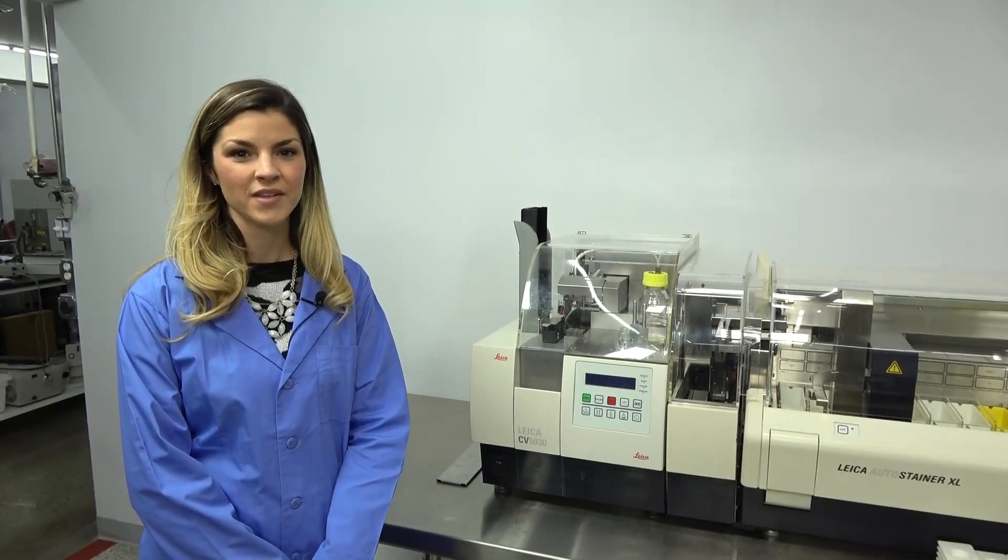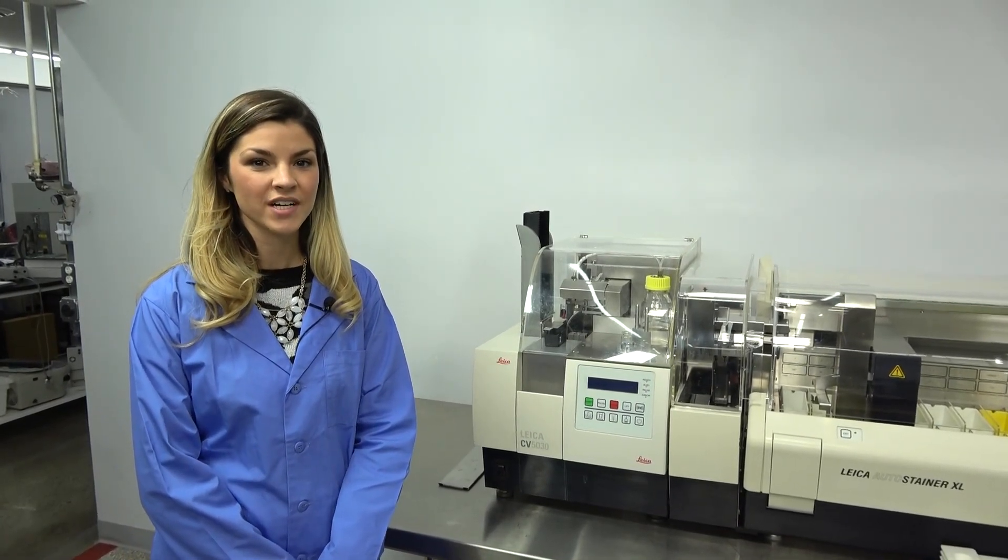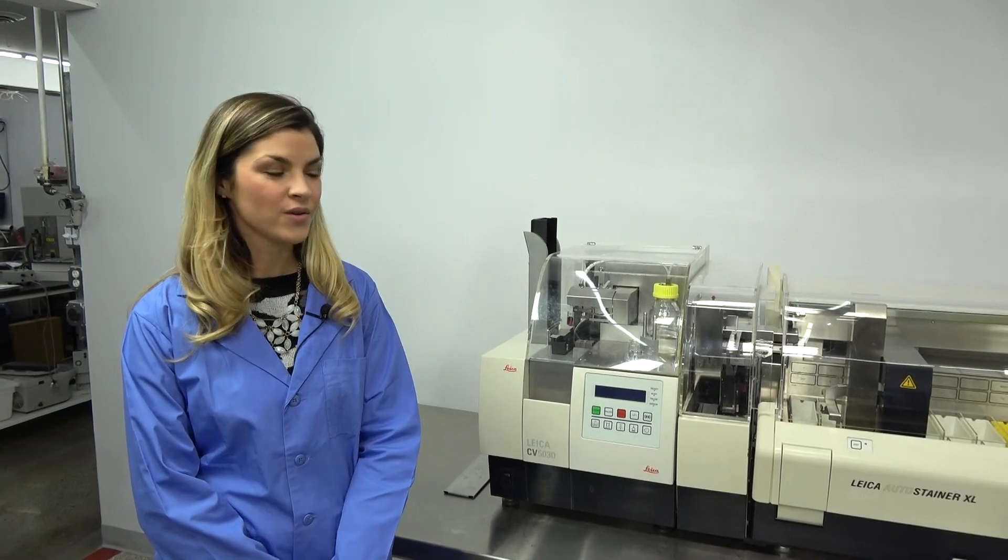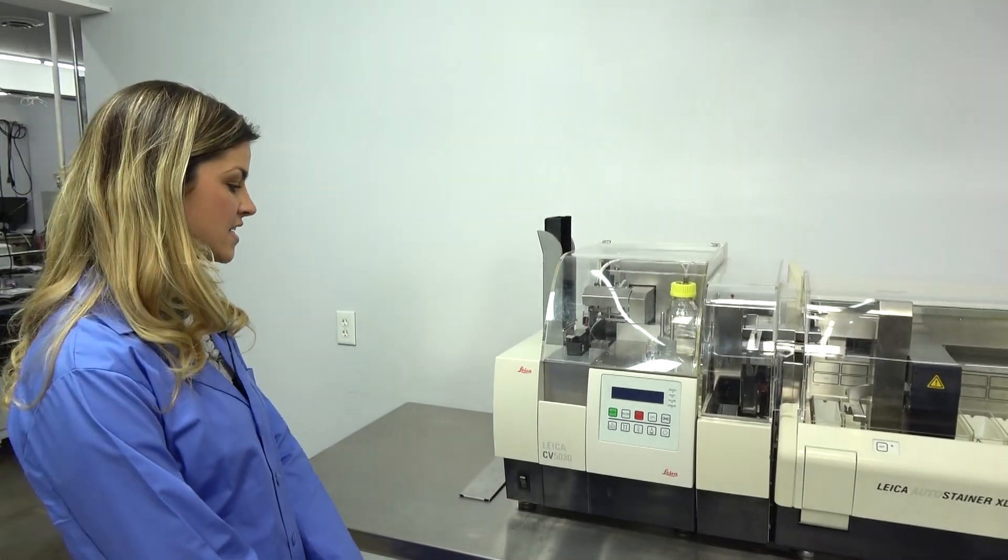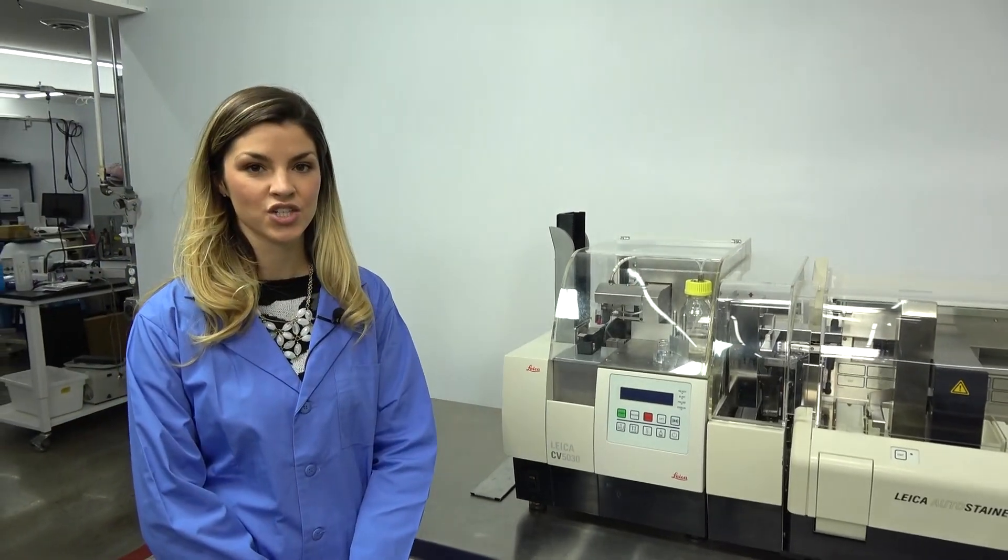Hi, my name is Heather and I'm here with New Life Scientific. Today we're going to discuss the Leica Auto Stainer XL and the Cover Slipper Integrated Workstation.